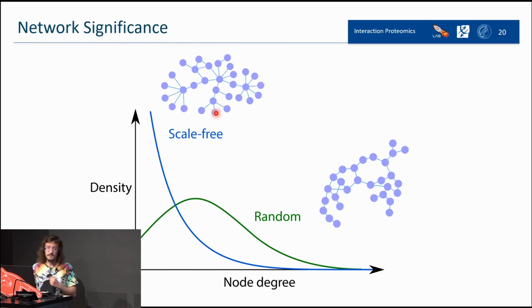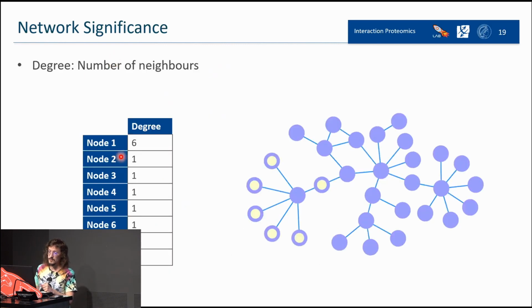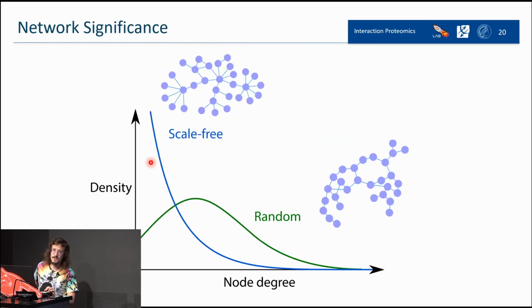While instead, when you build a scale-free network, something more representative of a biological situation, of what usually happens in a cell, you have a lot of nodes with a low degree, and then further on, way fewer with higher degrees. The peak is at the lowest degree, sorry, on the low end.